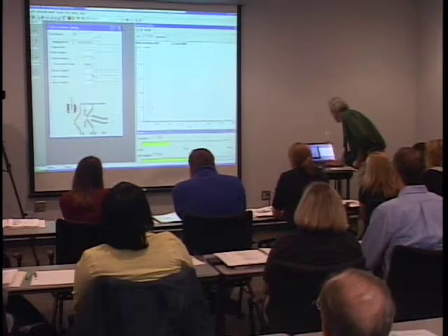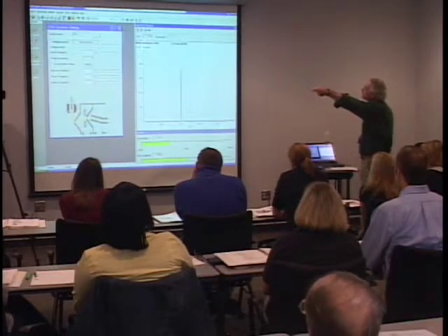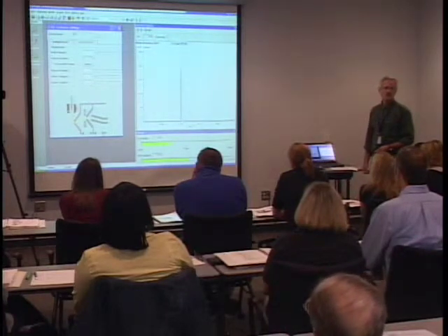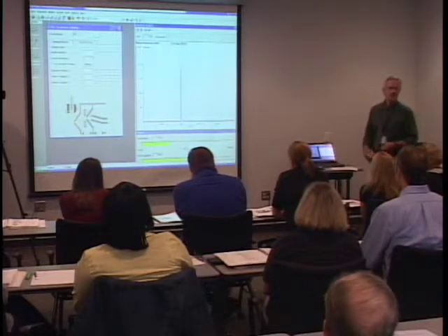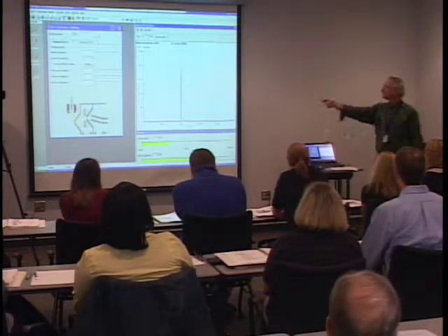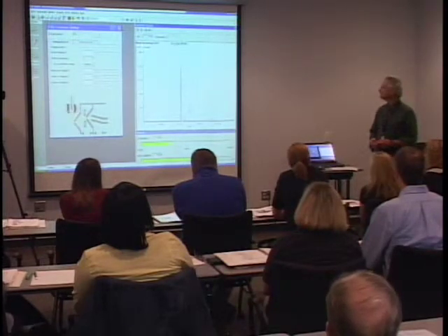Here's our mass 37 peak. You see the measured resolving power is about 2,500 — about double what it was at mass 19. The intensity is a relative value. If you were to set the DART up for the first time, you'd want to adjust the angle and position everything to maximize this water peak. That means you have good signal-to-noise and everything's ready to go.